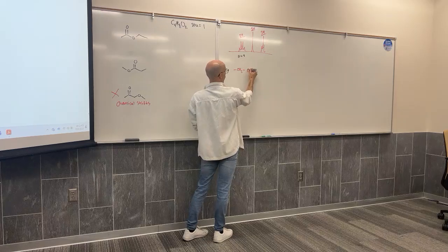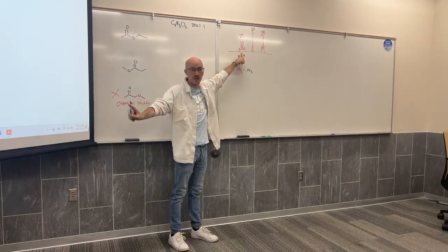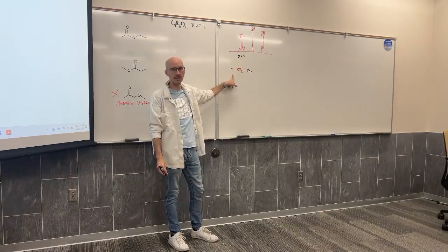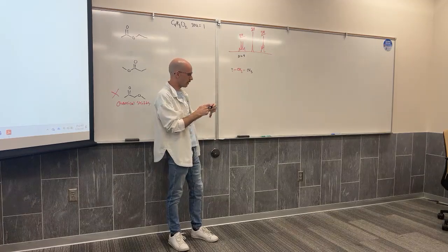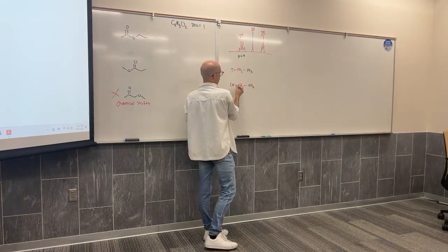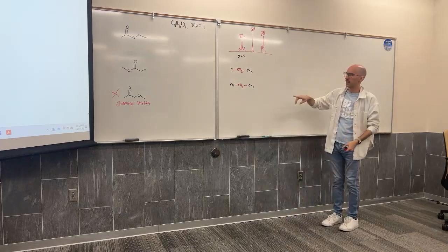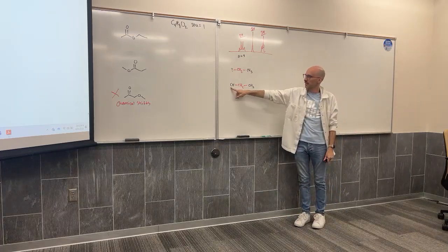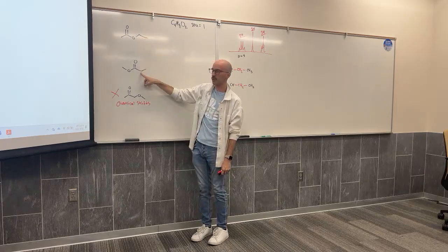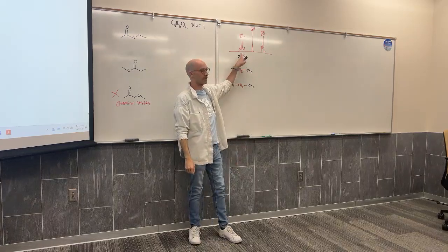That has 3 neighbors. Well, I could have a CH3 on one side, and I don't know what's on the other side, but given that its chemical shift is past 4, this is probably a functional group. And given that it only has 3 neighbors, whatever this group is doesn't have any hydrogens on it. Or I could have a CH2 group that has a CH2 on one side and a CH on the other side. That would also give me 3 neighbors. Well, if I look at my 3 possibilities, I never see a CH2 group that has 1 H on one side and 2 H's on the other. But I do have 2 structures where a CH2 has 3 hydrogens on the other side. So either of these structures agrees with this signal.